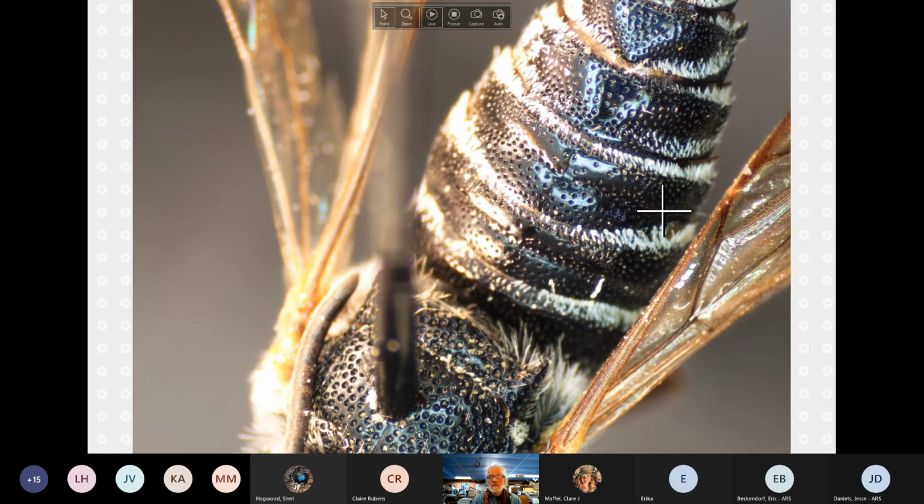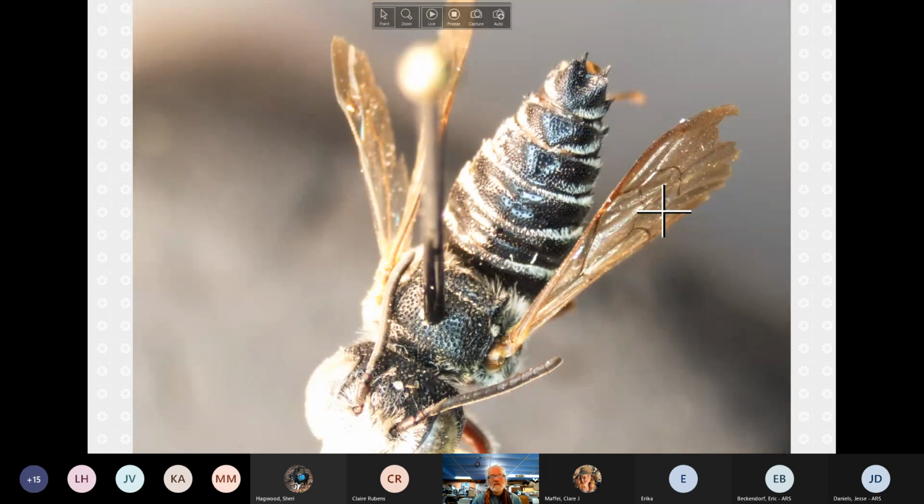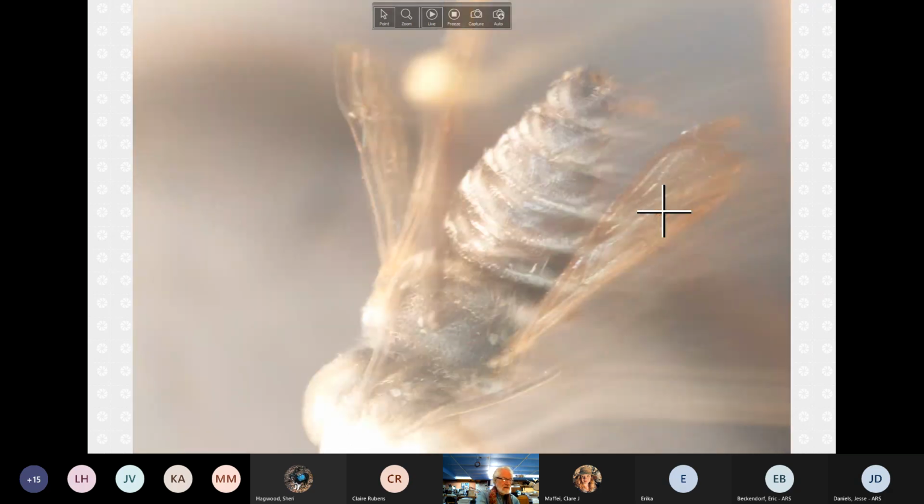In octodentata, you see this pitting run all the way across. I have spent so much time looking for some alternative to that character, and have, as I'm sure others have, and have not found anything different. In general, sayi is ubiquitous, kind of everywhere. Octodentata, I think, may be more associated with Megachile brevis. So all the Coelioxys, I think, are nest parasites on Megachile. People can tell me if that is not the case. These nest parasites do like to jump to other groups periodically.